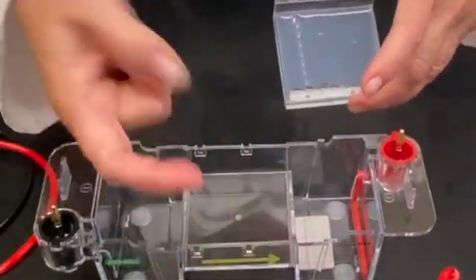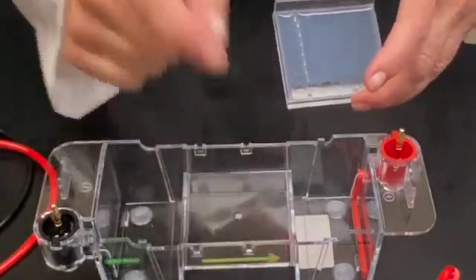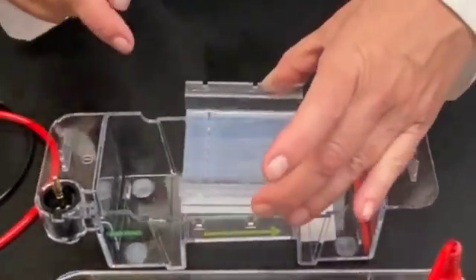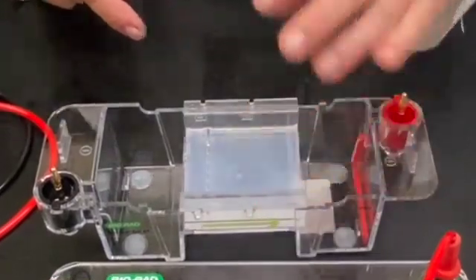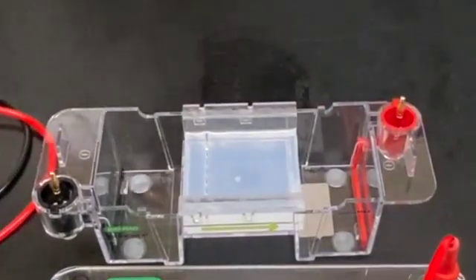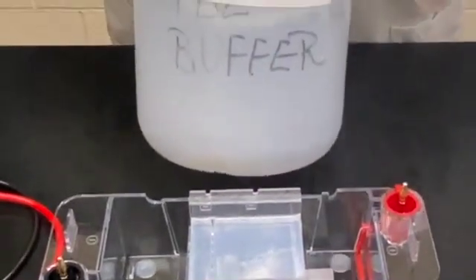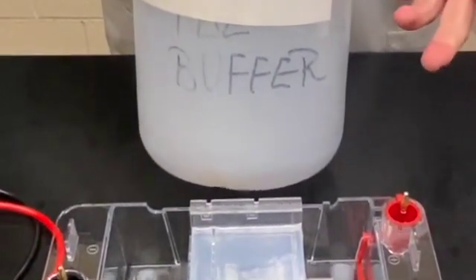The DNA or the proteins are going to run in this direction, so I want the samples to be up close to this side. The next thing that we're going to do is pour in some buffer. This buffer is called TBE buffer and it's basically salt water.